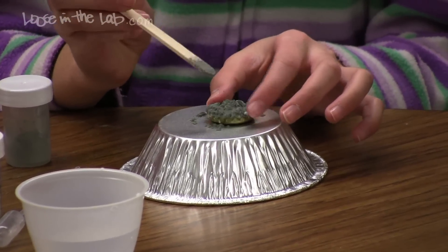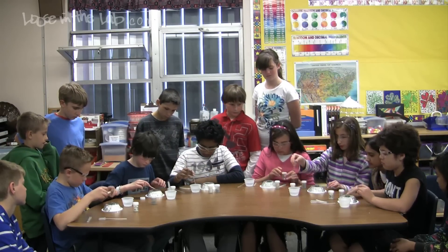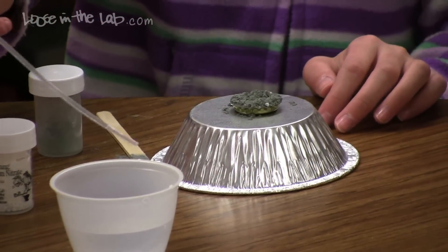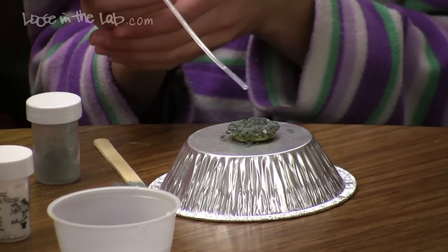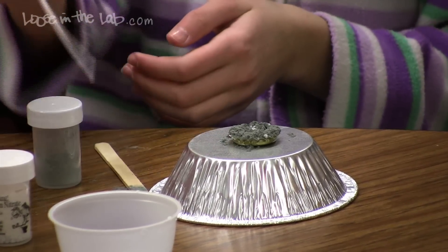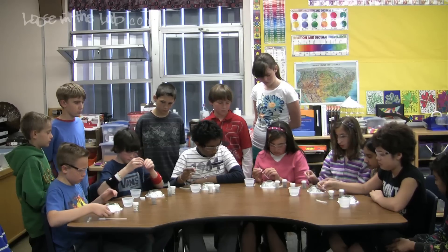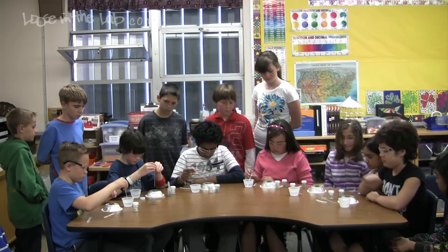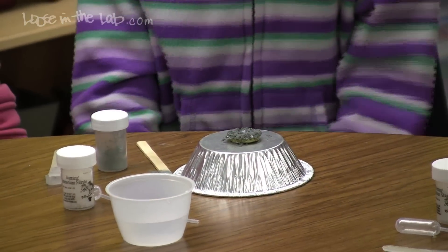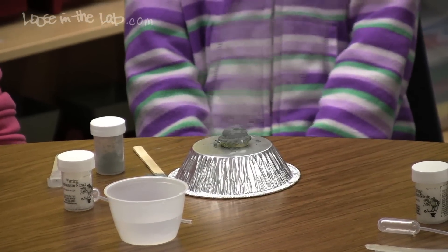Then take your pipette, slurp up some water, and add two drops of water to the center of the bottle cap with the chemicals and watch what happens. Squeeze the bulb, add two drops. The most important thing is not to be impatient — once you add that water, just sit back and enjoy the show.